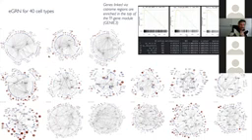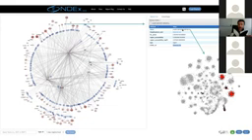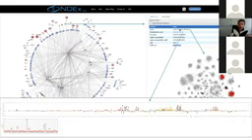Okay, thank you. And then this is the result of 40 different of these GRNs that we are now making available through quite an interesting website. It's a bit like Cytoscape, but in a browser, where you can actually click on nodes and regions. Clicking on this region gives information about where that region is in the genome. Can I go to the UCSC genome browser? Can check the region in Scope for where it's accessible, and a link to the DeepExplainer neural network that I will show in a second.